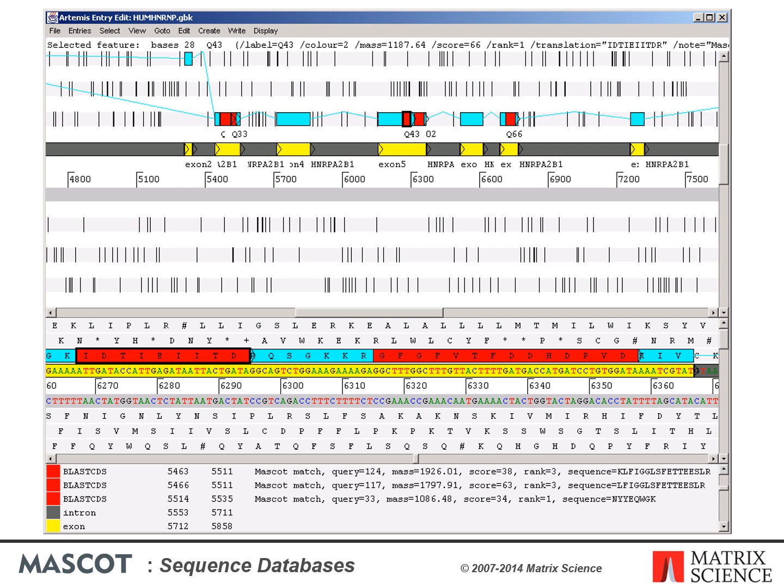In the upper third, we have a low-resolution view. This can be zoomed out to show an entire sequence as a single strip. We have the forward and complementary DNA strands and the 6-frame translation. The vertical bars are stop codons, the yellow blocks are exons, while the blue blocks here are coding sequences. Individual Mascot peptide matches are shown in red, and this particular gene has 8 peptide matches.